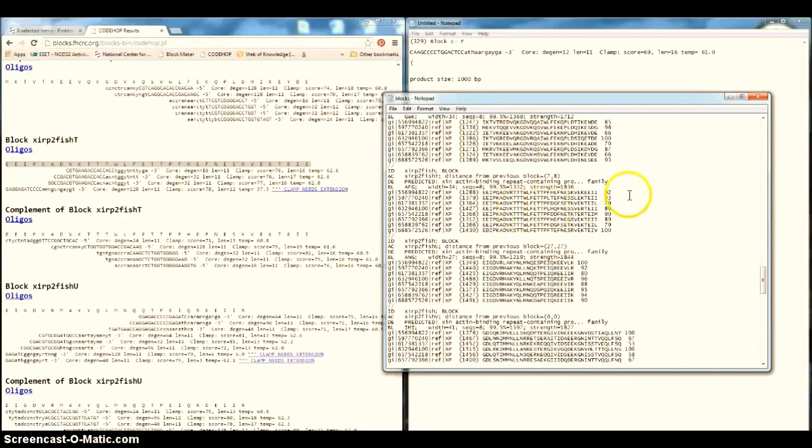But you see the percentage of similarity between all species. If you write the name, which is what, in the first sequence text document, you can see which fish each line belongs to, but now it doesn't matter for understanding. Later you can do that, or I can show you how to do it with other multiple alignment software.